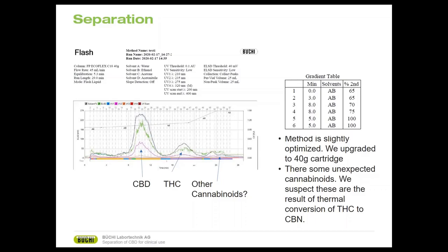There is a very tiny peak on the end. So this oil was put under the thin film distillation. Under the thin film distillation, as we mentioned, there is a rotation column, and this rotation column is heated. So we can evaporate the terpenes and the chlorophylls later on. However, while you have the cannabinoids and when they are heated, we know that the heat converts THC to CBN.